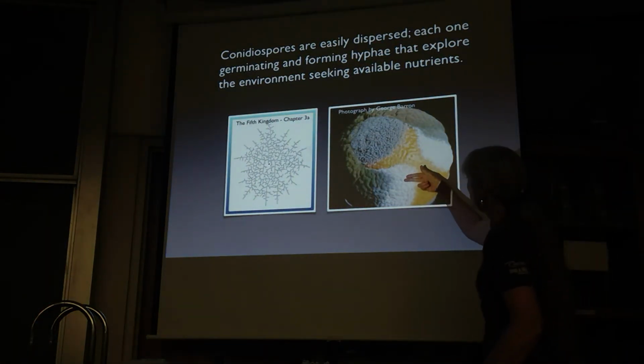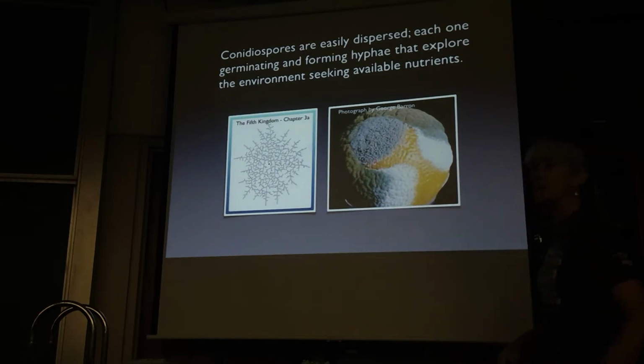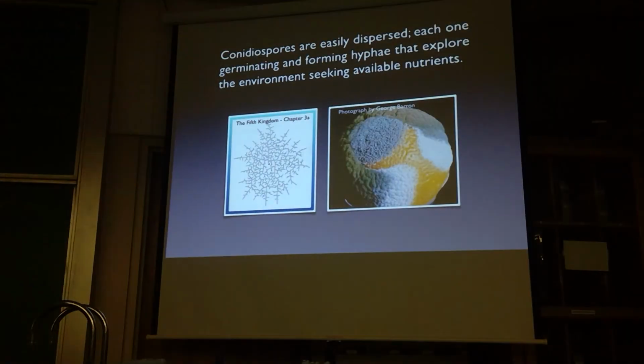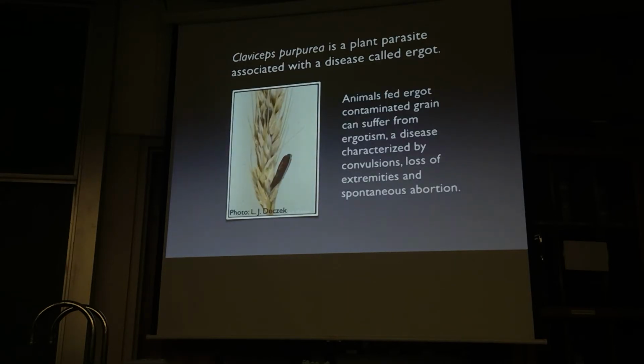This is mycelium. This blue colored and green colored, those are conidiospores. If you touch it, it comes off on your fingertips. If you see that green color on a chunk of cheese, you have to think, okay, that's aerial mycelium. What's in the cheese? Vegetative mycelium. Then do you chuck that cheese, or do you cut it off? Depends on how desperate you are to eat that cheese.